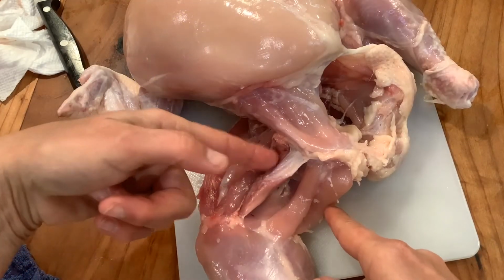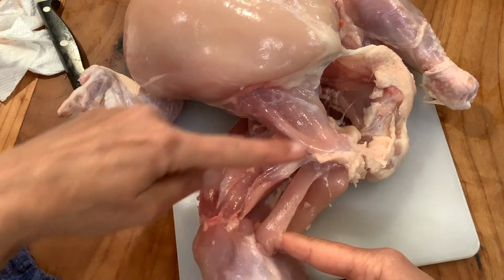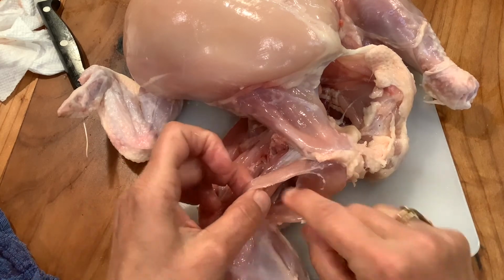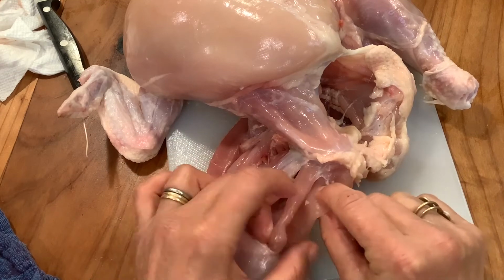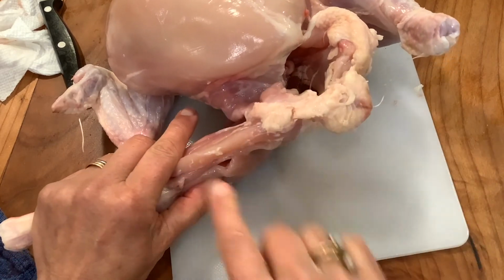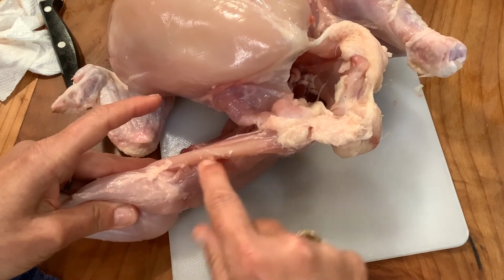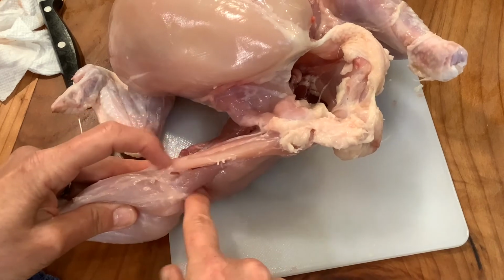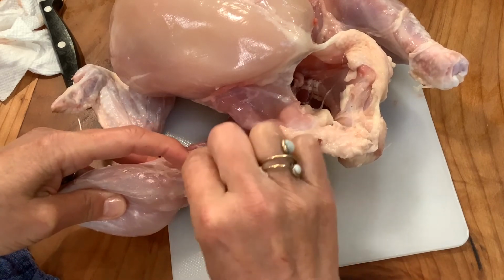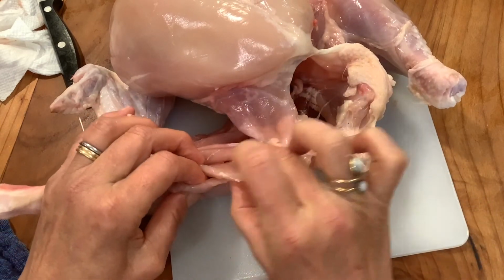And the bottom half of the chicken's leg below its femur, this is the gracilis, which was the most superficial one. That was a little straight one that went right across. And it's pretty thin, just like it was on the cat. And then underneath it, there's the hamstring group. So if you look at the back of the chicken's thigh, it has its three hamstring muscles. The biceps femoris goes to the lateral side of its tibia, and the semitendinosus and semimembranosus go to the medial side. So these two I pulled apart. There was a little bit of fat between them, so I could pull them apart. This is the semitendinosus, and this next one is the semimembranosus.